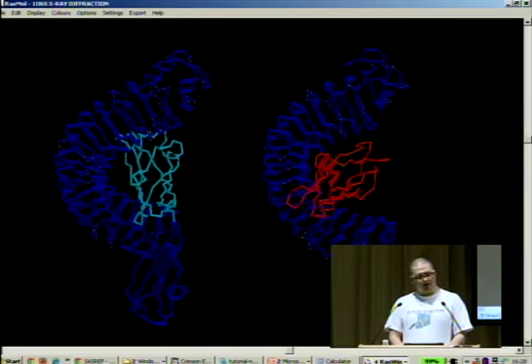So I hope I gave you enough practical information of how to use small angle X-ray scattering data if you want to model complexes. And I am ready to answer your questions.